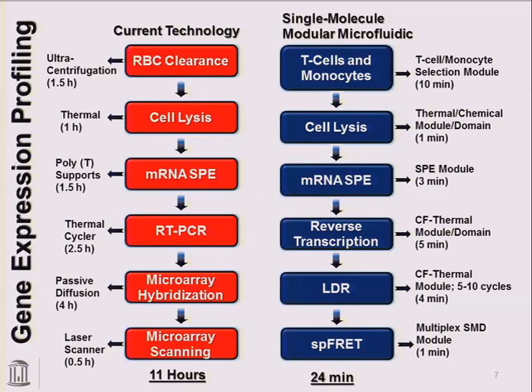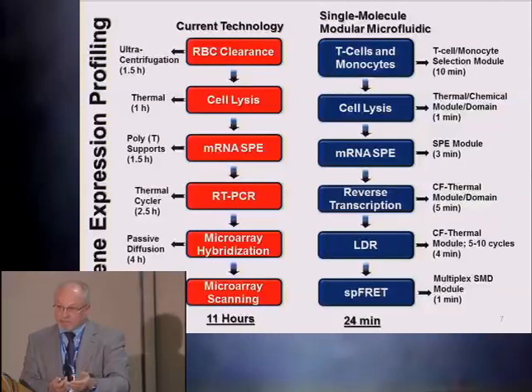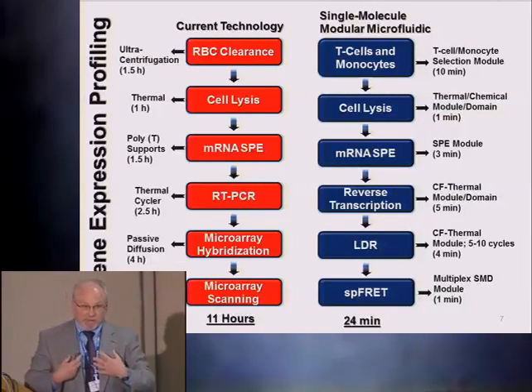And the one thing you'll see in these boxes right here, there's one abbreviation that's not there. PCR. We're getting rid of it. And why are we doing that? You know what? It amazes me. PCR is not a very good quantitative tool. Have you ever looked at the yields that are generated as a function of cycle number or copy number? It's very non-quantitative. You have to do a lot of processing in order to make it, from a statistical perspective, quantitative. So from a quantitative perspective, you'd really like to be able to negate the need of doing PCR. That's the analytical perspective on that.